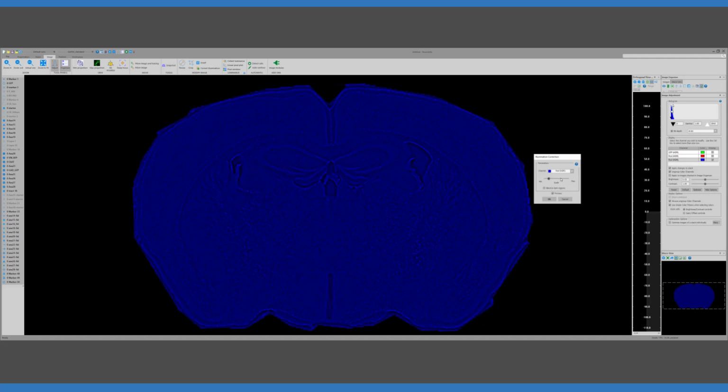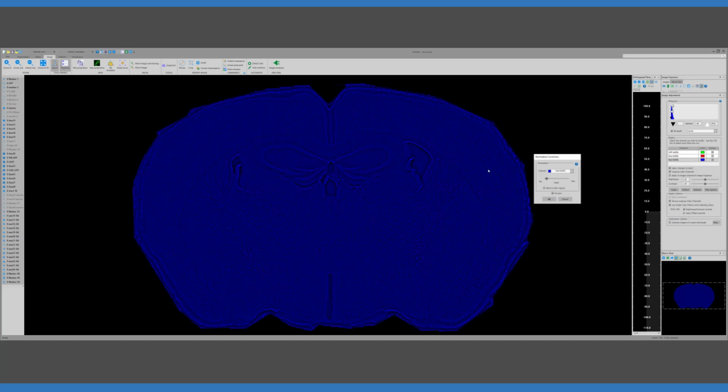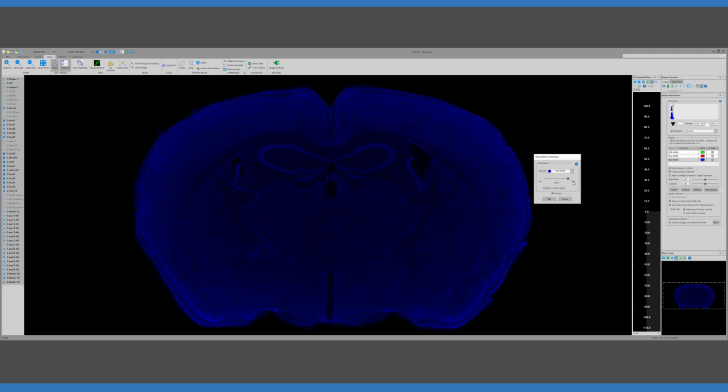And that scale parameter that you're working with right now determines how wide a region is evaluated during that process. Smaller scales tend to flatten the intensity variations much more than a greater scale. The larger scale allows for more variation between regions, and a smaller scale basically enforces that all regions will have nearly the same intensity.